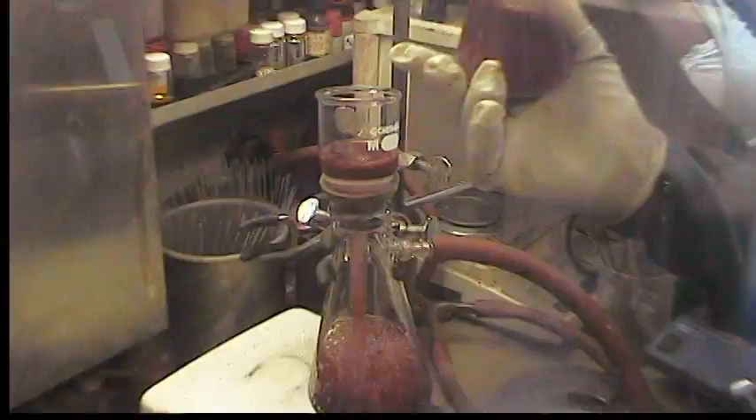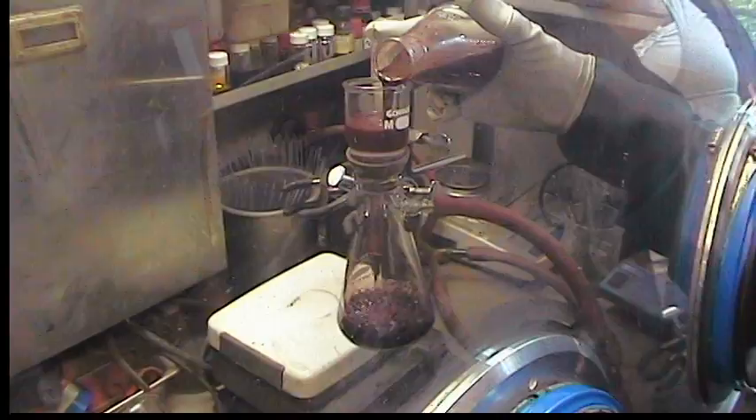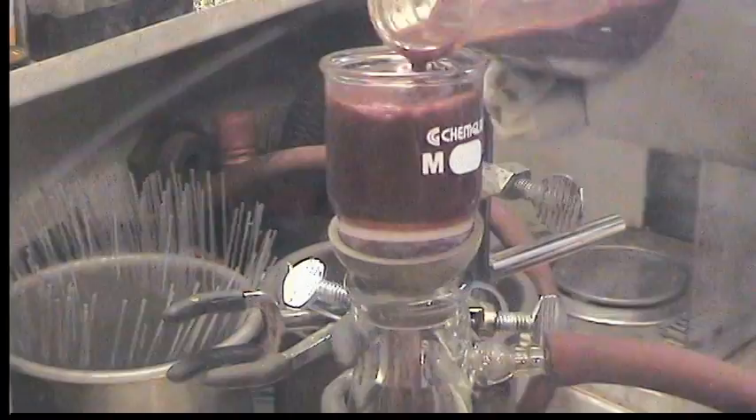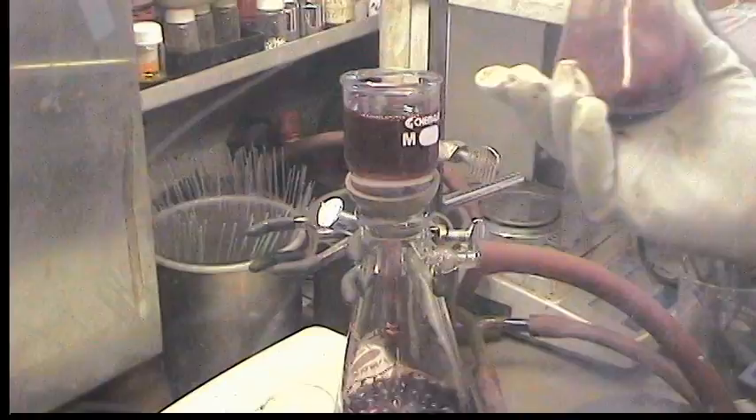It should be purple. Is it purple? I don't want to judge the colors. The filtrate looks purple. And we just don't want to turn the flask upside down because the tin would then also exit the flask.